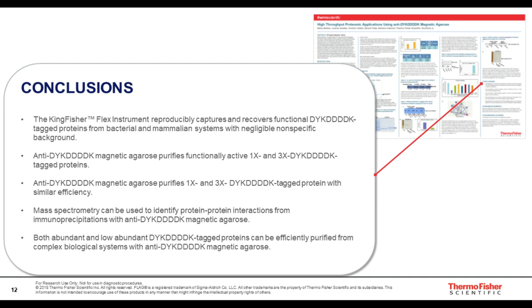You can also use, in the case of magnetic beads, where you have a higher capacity than you might need, less beads, which will lower your cost per sample. And in addition, if you can use less beads, potentially you can reduce your background if you're working with a particularly sticky sample.